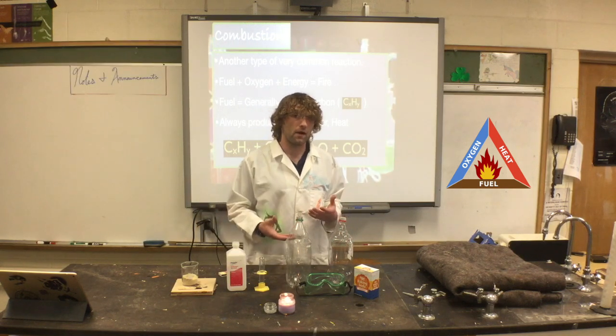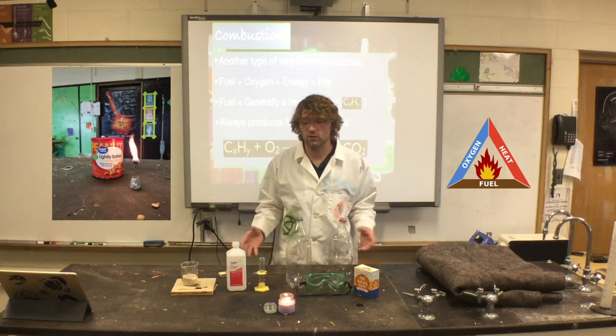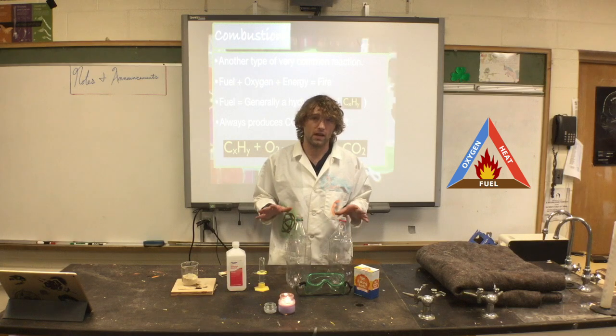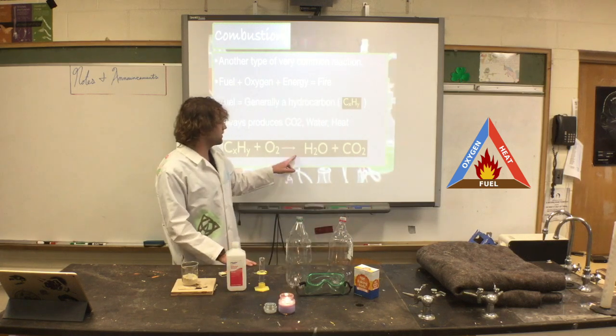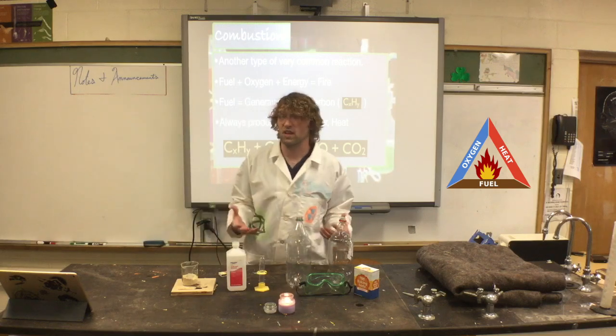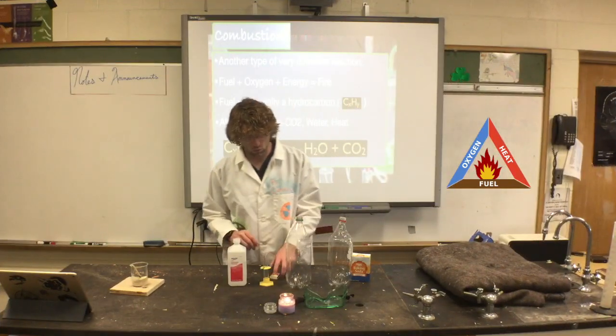So we've been talking about this. We've done some actual experimentation with combustion by burning our peanuts to see how much mass is lost. So today's demonstration is all about getting into the nitty-gritty of this equation and what all of that means in a practical sense. The first three demos will be an alcohol demonstration. Let's go right into those.